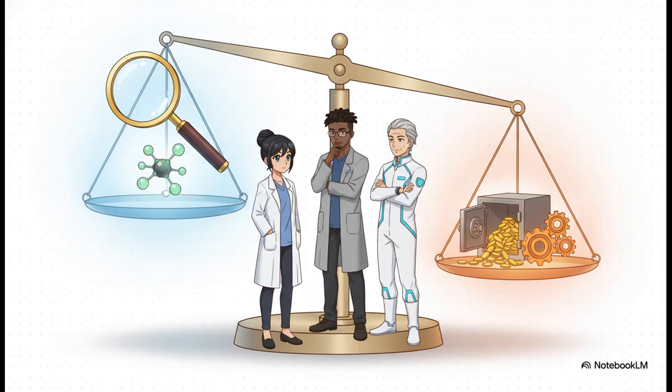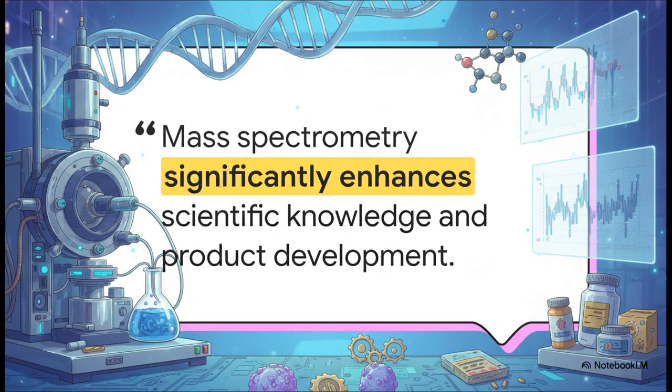Of course, it's not all magic. This immense analytical power comes with some real trade-offs. On the plus side, it's a real game changer because it offers incredibly high sensitivity, dead accurate molecular weight determination, and you only need a minuscule sample to work with. But we have to balance that against the challenges. These instruments are staggeringly expensive. Plus, there is a huge operational complexity that requires highly specialized knowledge, not to mention the labor-intensive sample prep we talked about earlier. But, despite those challenges, the ultimate verdict from the scientific community is loud and clear.